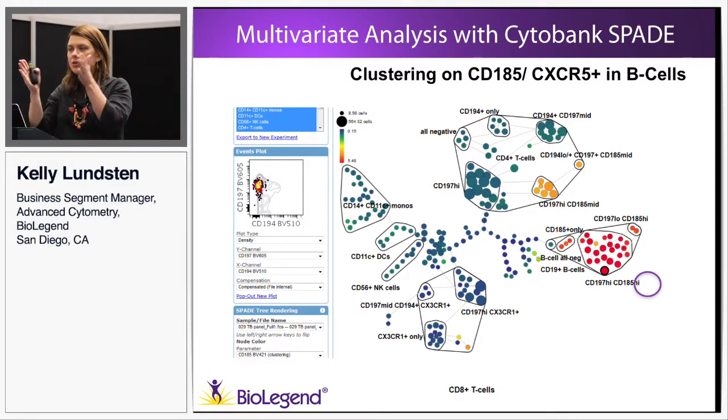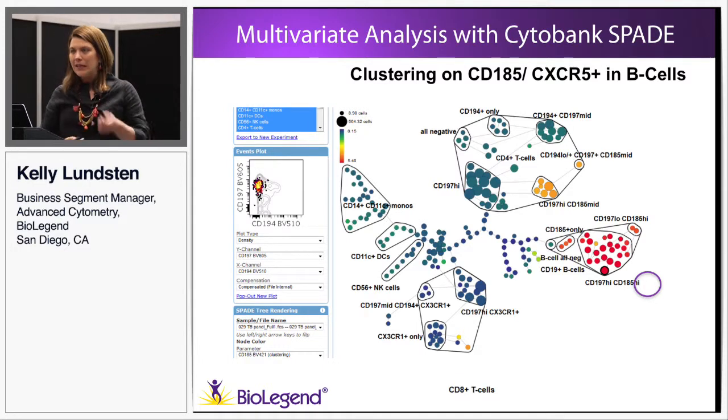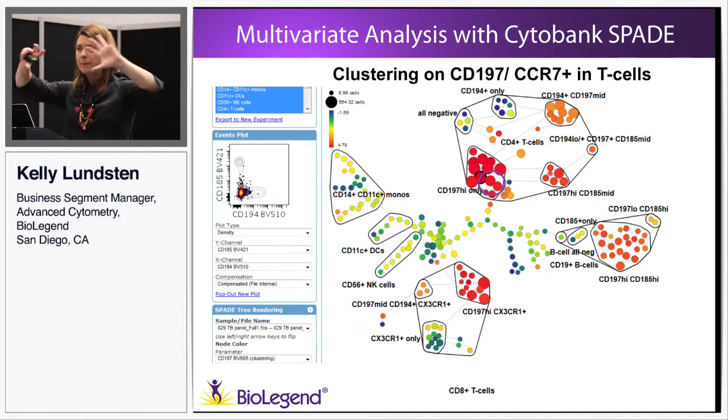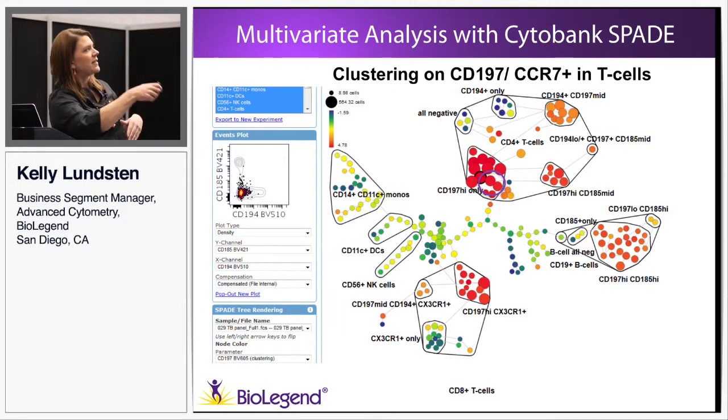I can reduce the degree of binning so that they merge together probably, but we didn't decide to do that in the 2 days that we had for me to analyze this data before the presentation. So what I loved was just my ability to curate the information. All right, so when I went to CD197, and I have to approach each of my chemokines still one by one, but I'm bringing up one, looking at its heat map, and organizing it. Then I bring up the next one and further organize it. It's just a step-by-step process.